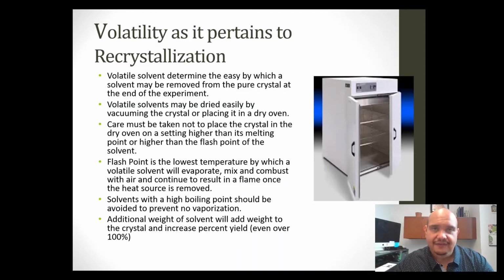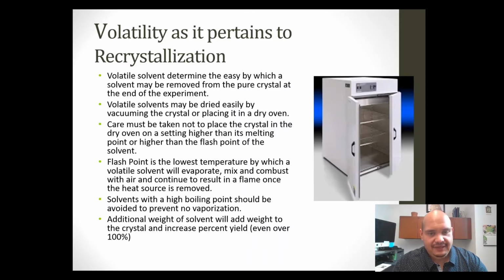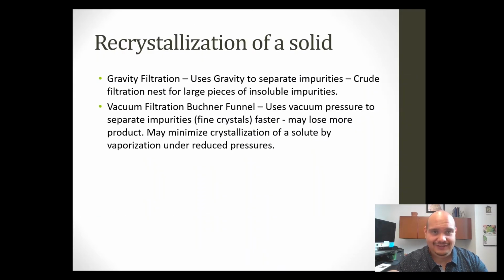It's just a technical error that exists for everybody, and it's pretty well understood that you won't get 100 back, okay? That has to do with technical skill, but also even the glassware that you use to recover something. If the graduations are good and you're doing a good job measuring, that's okay. If you're kind of estimating or eyeballing, which you don't want to do too much, but you can because this class is not quantitative, it's qualitative, you also realize that your yield is going to be a little bit affected, and that's okay because this class, again, is qualitative, not quantitative. So we're not in quantitative chemistry anymore, thank goodness.